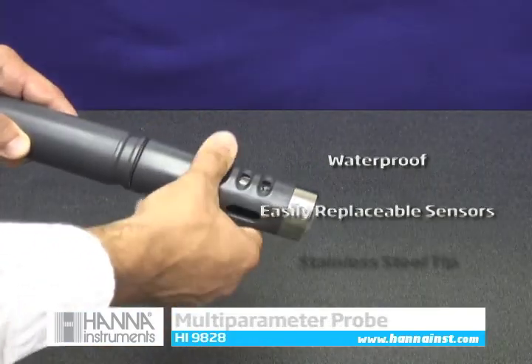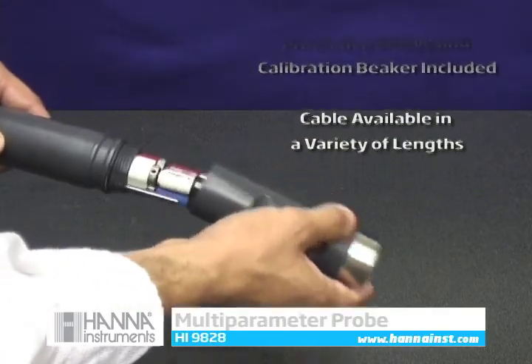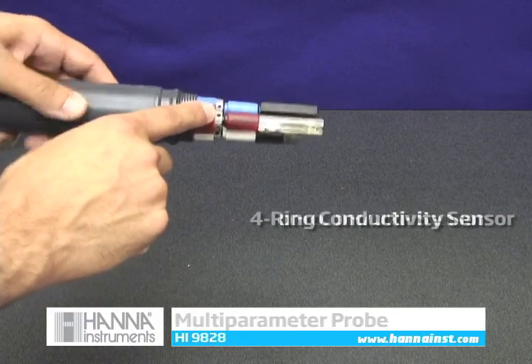The multi-sensor probe is less than 2 inches in diameter, enabling it to accommodate 2-inch wells. The flow-through protective sleeve has a stainless steel weighted tip for depth measurements. All sensors are field replaceable and DO membrane replacement is easy with screw-on membrane caps.